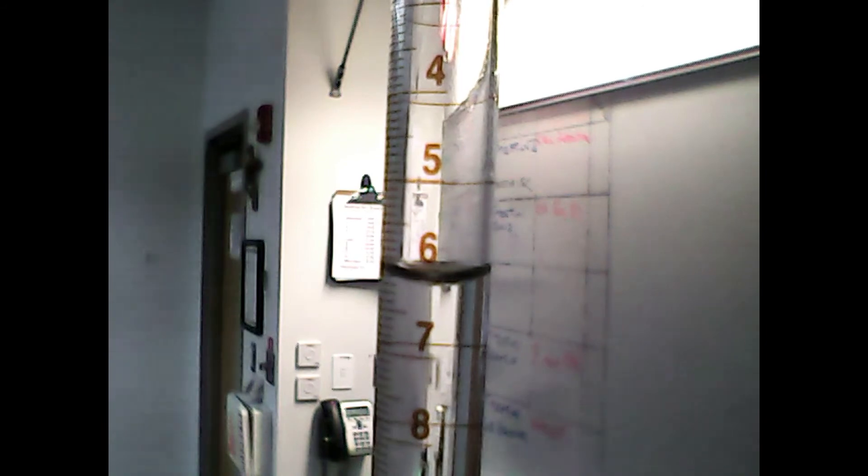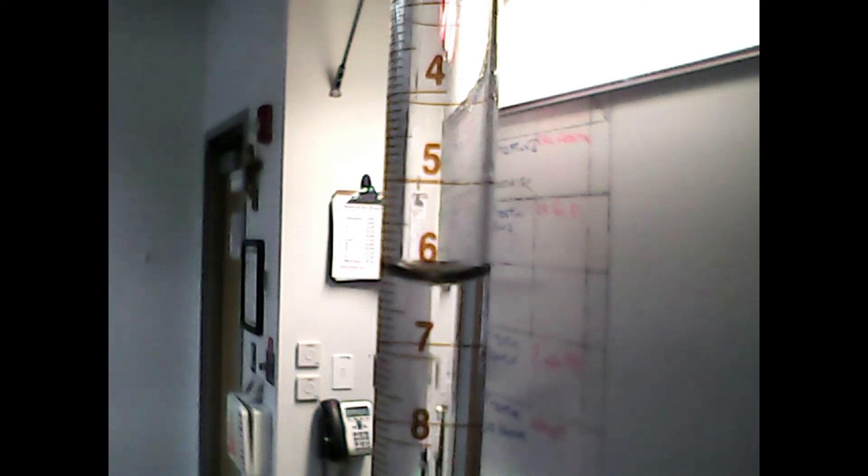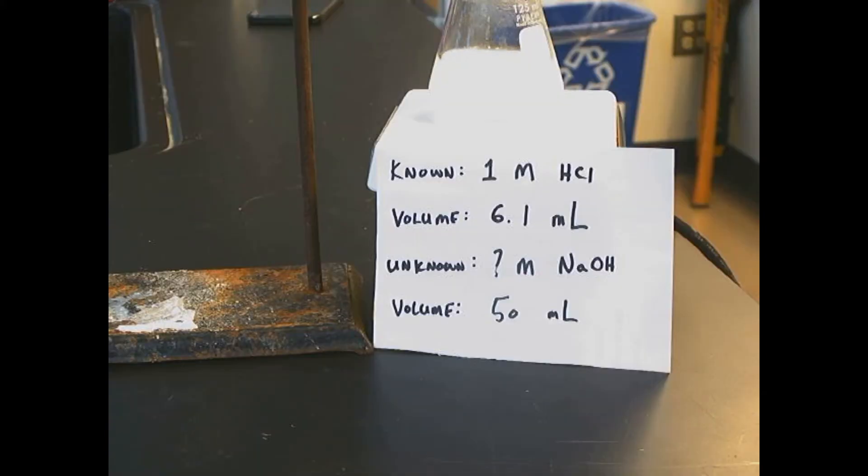Reading the burette, just as the solution turns back to clear, means we added 6.1 milliliters of our acid. So now we have a known volume of known concentration of our hydrochloric acid, and we have an unknown concentration but a known volume of our base.